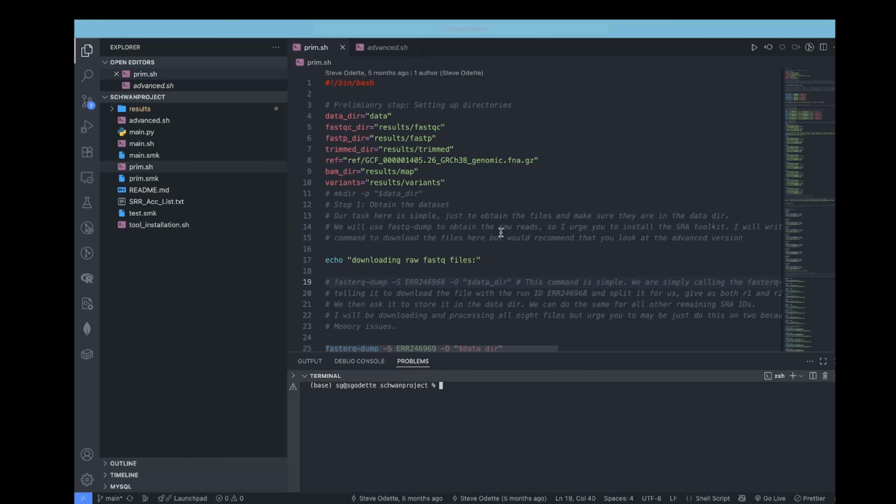I am glad that you are returning to this series of videos where we are trying to build an end-to-end bioinformatics pipeline using Snakemake. Now, the next series of videos are the most important for this entire series of tutorials because we will begin scripting the workflow, first of all in Bash, and then transferring everything as it is into a Snakemake utility.